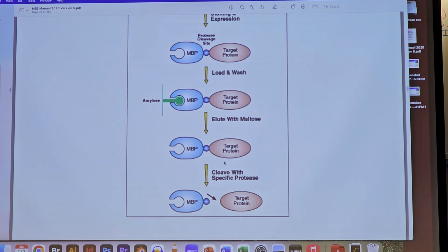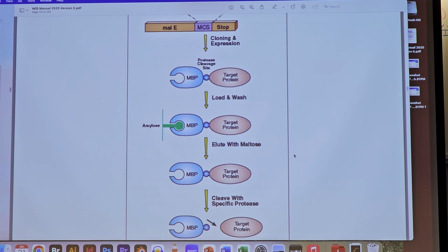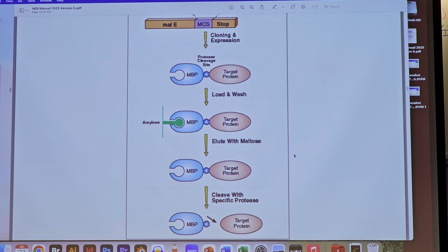Any questions about the purification system? The system works generically with any protein you might care about, or is there something special about our GAPDH that allows it to work? We've used this for proteins that we clone the genes for, from parasites that we work on, from viruses that we work on, from mosquitoes we work on. So for us, this has been great.